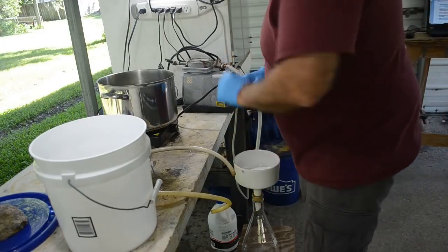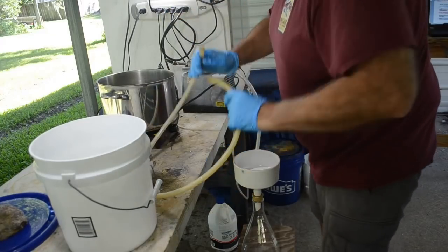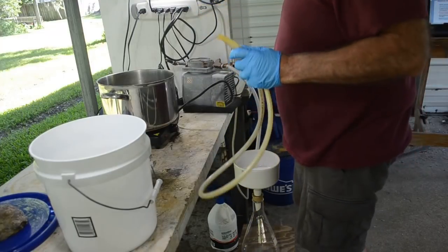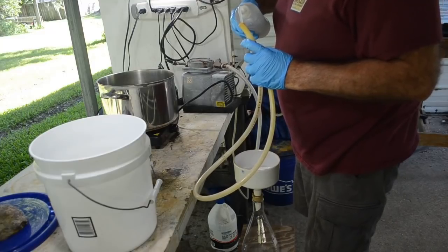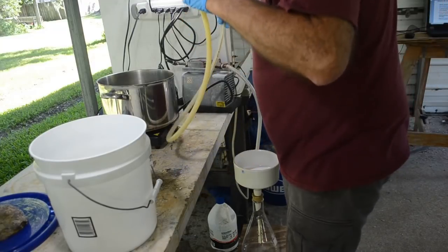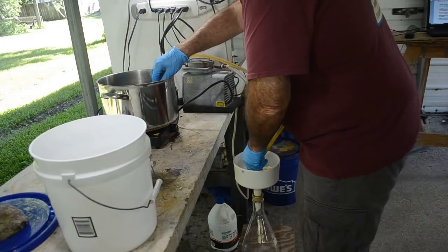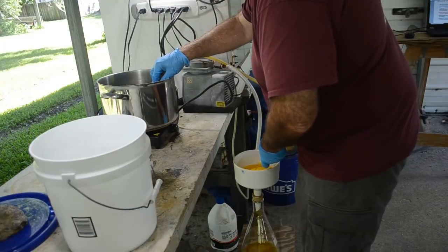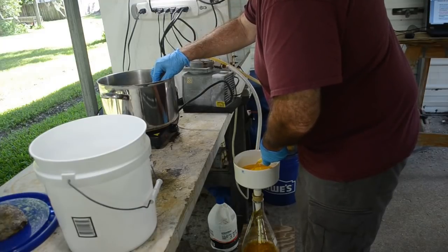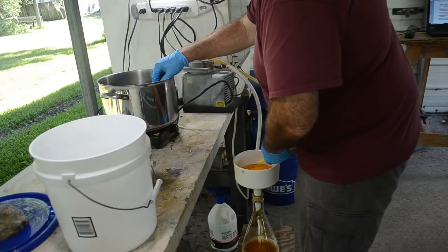So let me get the vacuum pump going. Get some water in this hose. Okay. There we go, and we're siphoning. And we're filtering. And it's going through the filter about as fast as it's coming into the funnel, so that's good. So this is just going to take a little while.